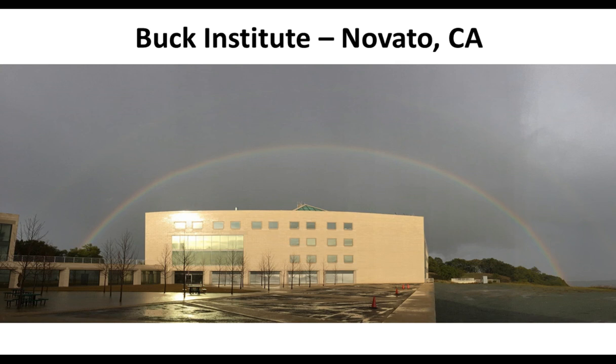However, we have talked with some other researchers where we have built some of our libraries out of the enrichment strategies, and we have given our libraries to some of our colleagues who then use these libraries in DIA mode and look for these peptides that we now know are there out of the entire lysate, without enrichment.